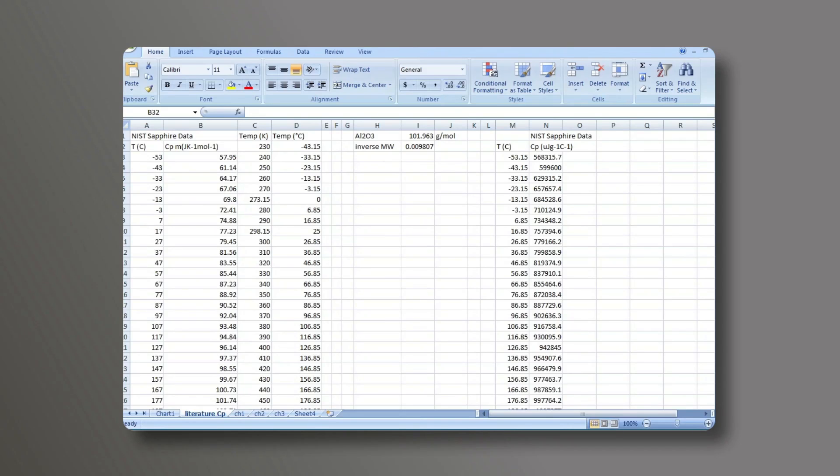In this first sheet, I've gone to either the internet or to the NIST website and got the theoretical values for the sapphire data of the heat capacity. So I have the temperature and heat capacity measurements that were provided to me.